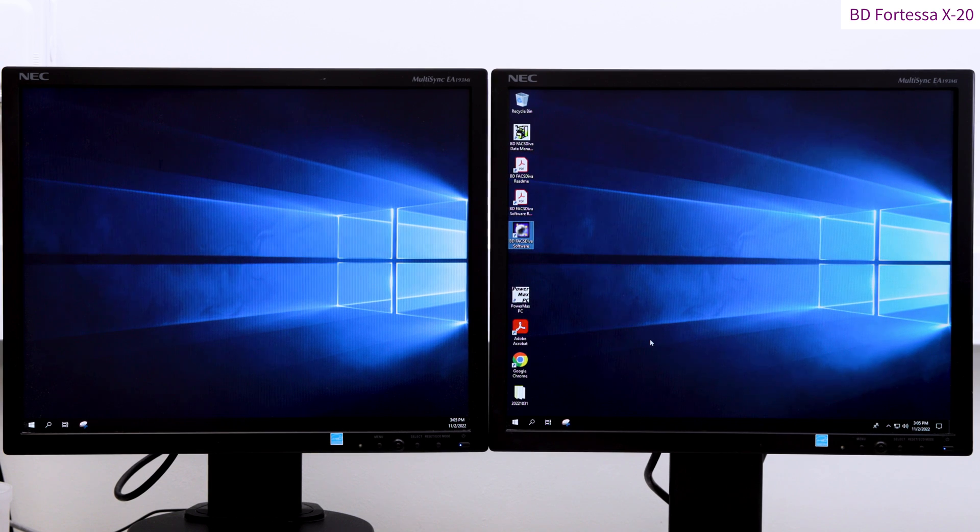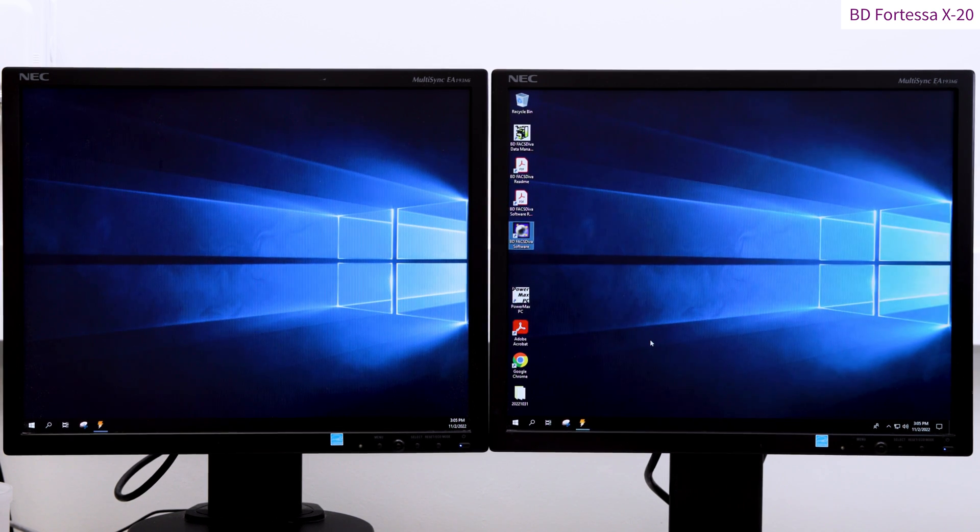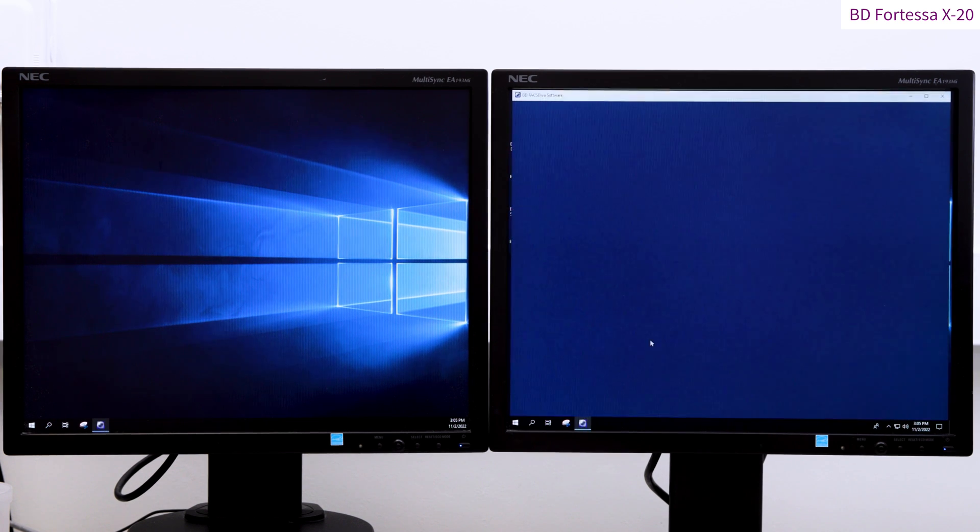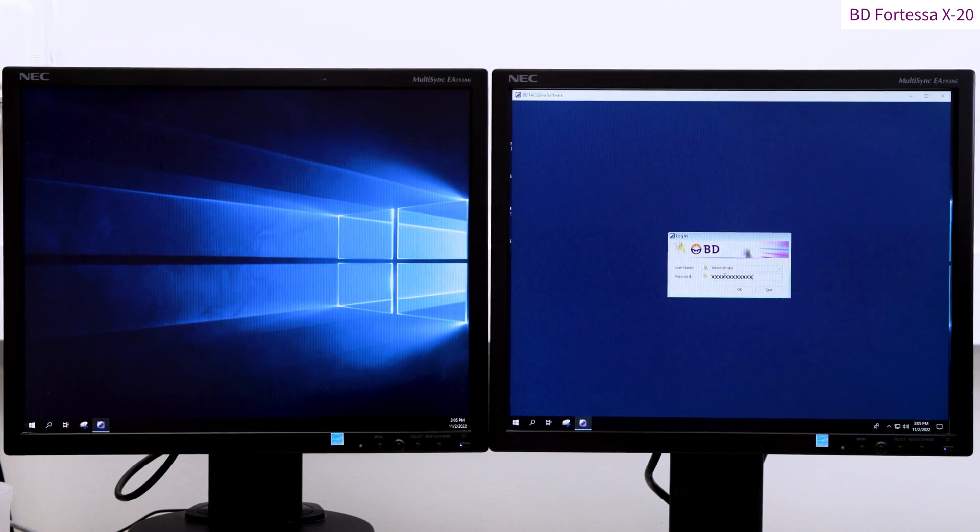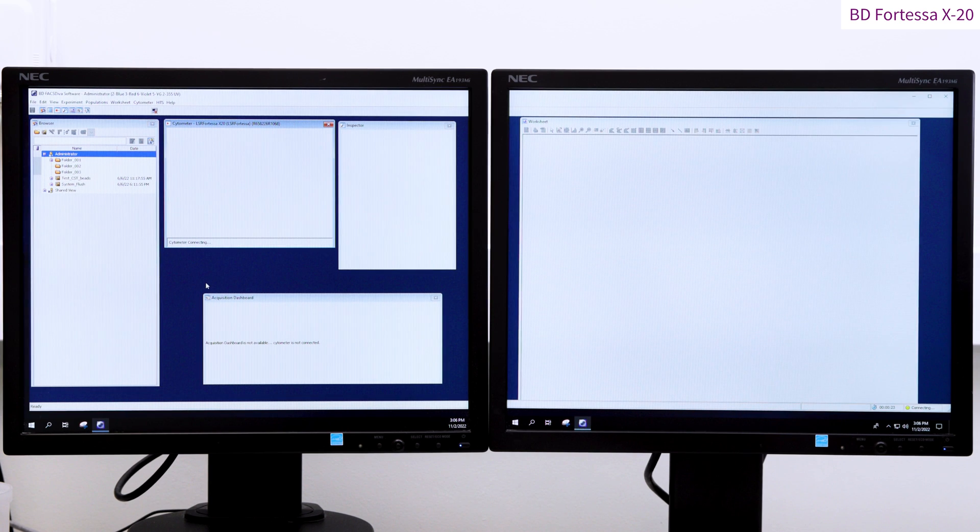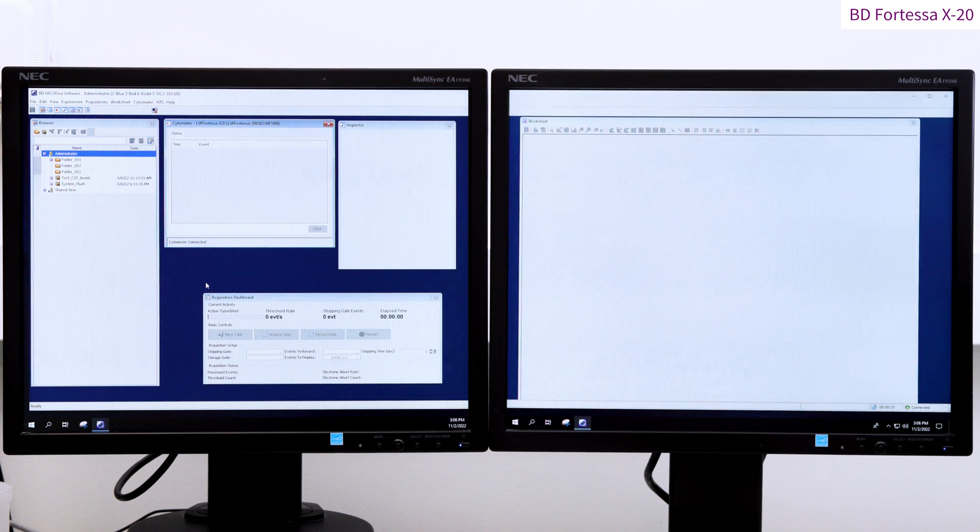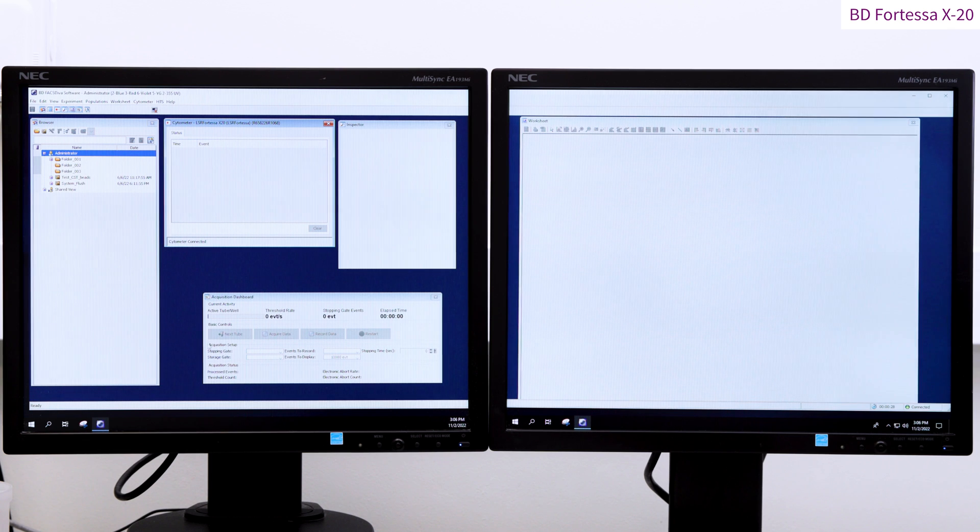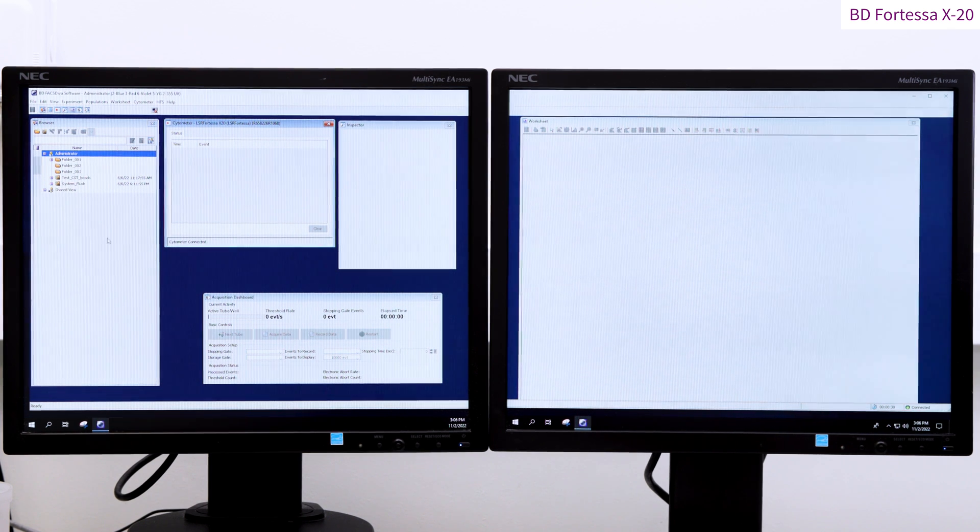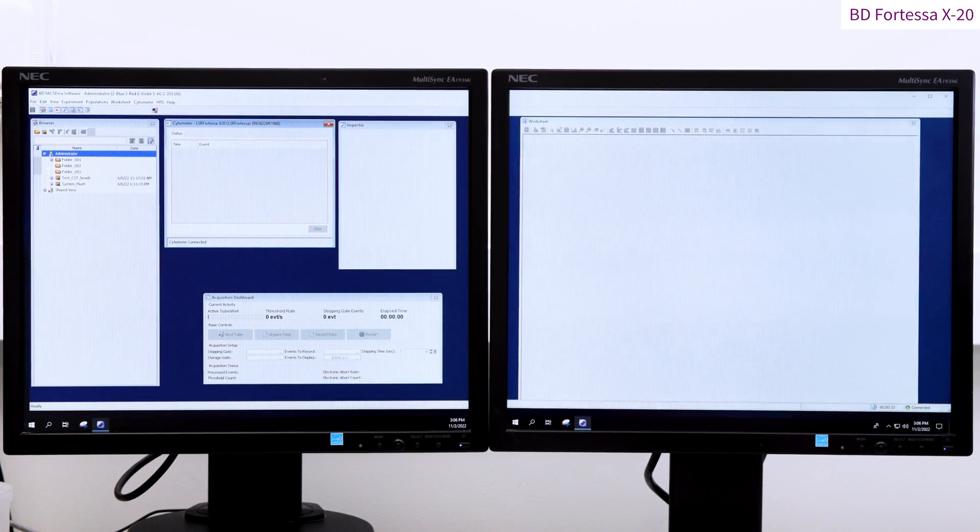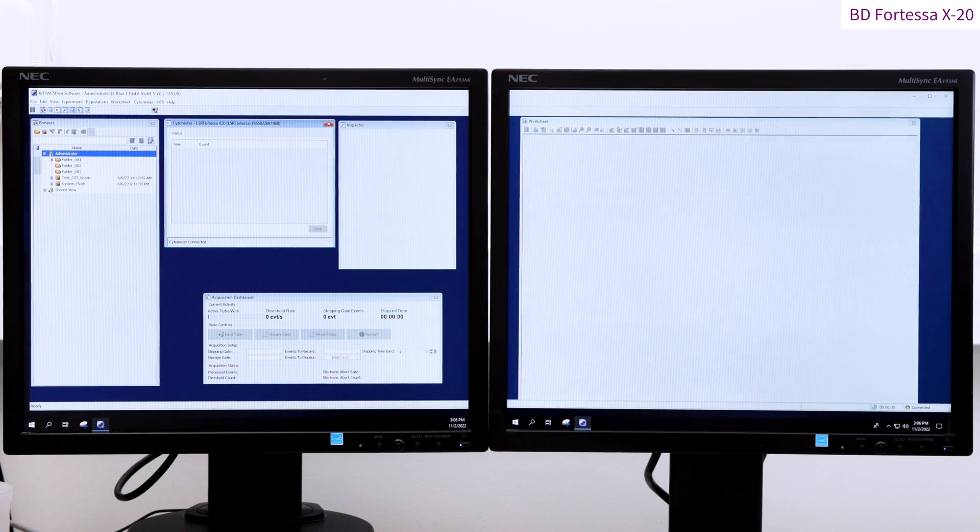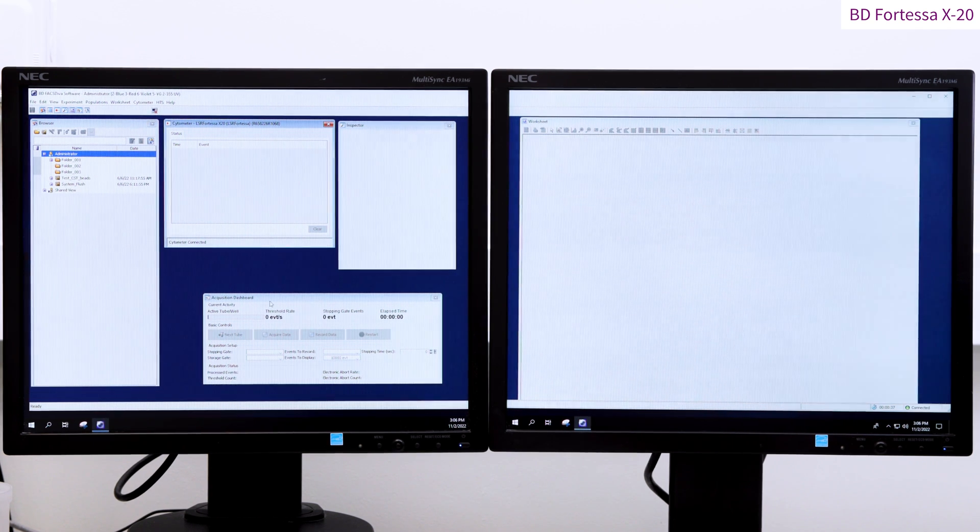Once the computer is turned on and you have logged into Windows, start the BD FACSDiva software by double-clicking the shortcut on the desktop. Log into the software. Please note that this video has been recorded with Diva version 9.0 and that some differences may exist between software versions. Diva will take a few seconds before connecting to Fortessa. The connection is established once the Acquisition Dashboard window is active and the Cytometer window gives the Cytometer Connected message.